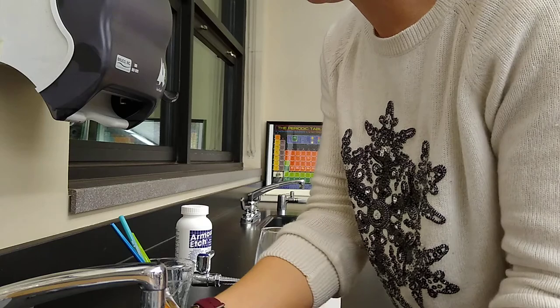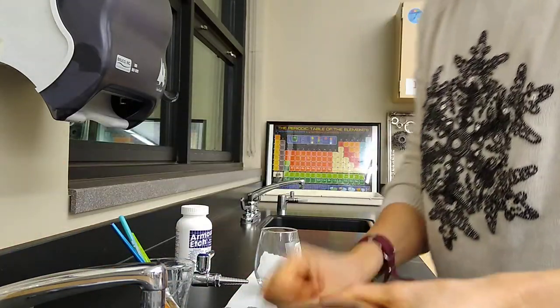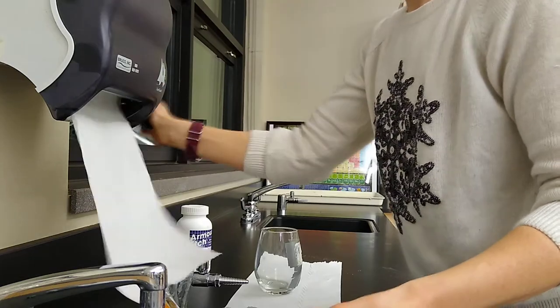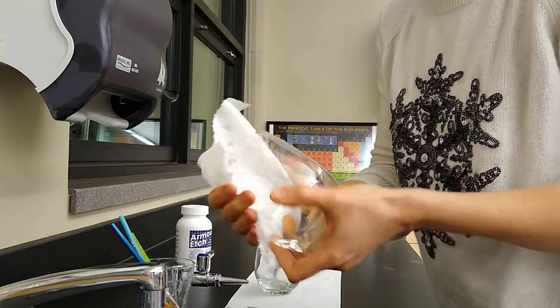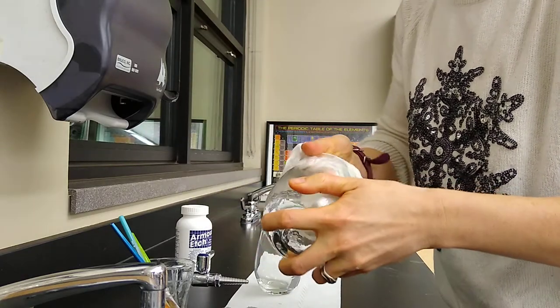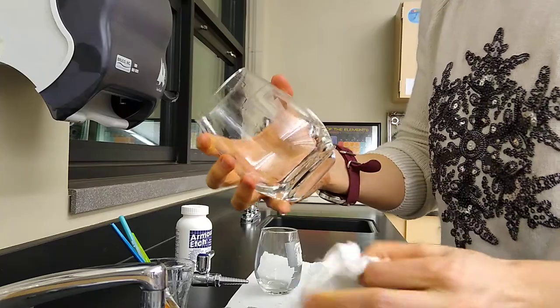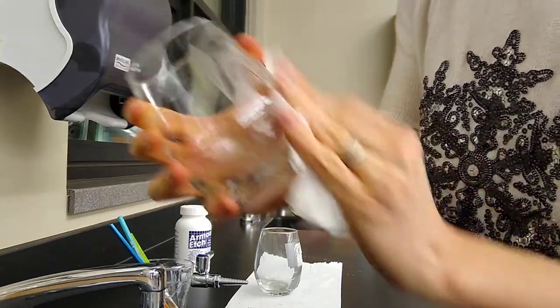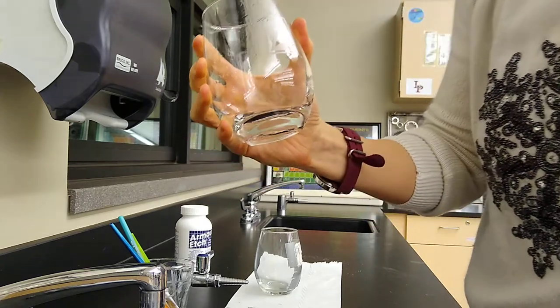Then dry it off for the final time. When you dry it, that's when you really start to see that etched product, so we end up seeing that nice crisp image after you dry it.